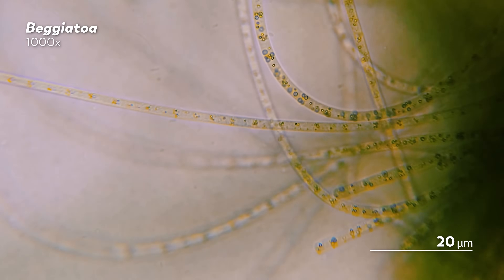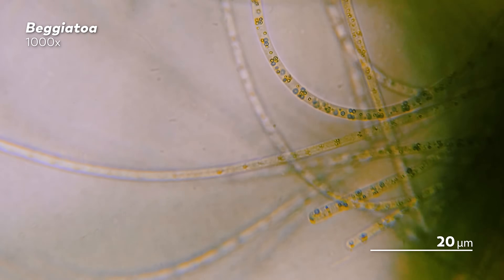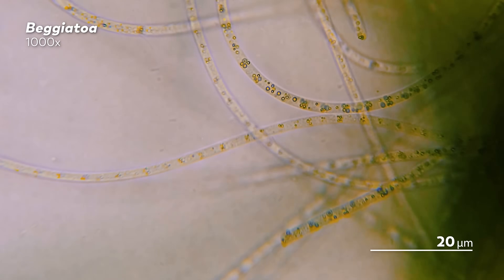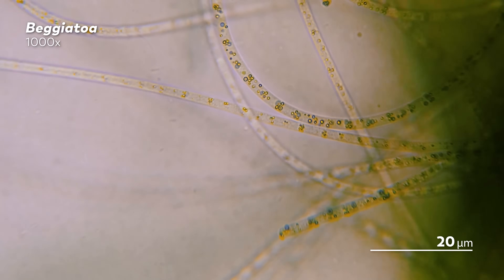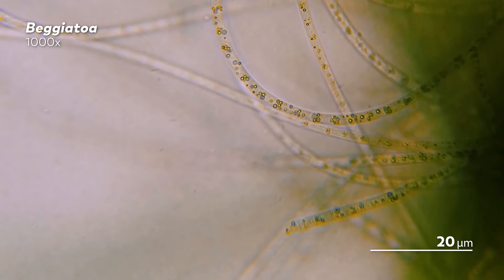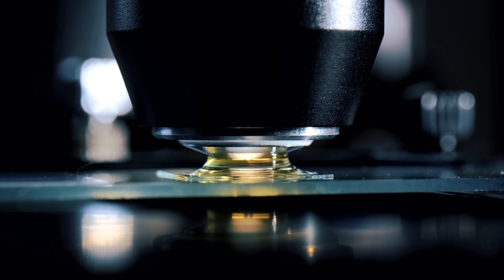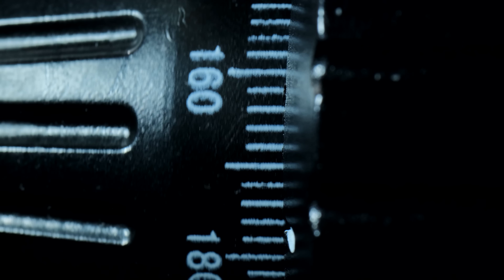To start, you'll want to prepare a slide like normal — you'll just need to really make sure the sample is very thin before you add the coverslip. Then take a drop of the oil that came with your microscope and put it on the coverslip. Using the 100x objective, turn the focus knob very gently until you see a clear image.